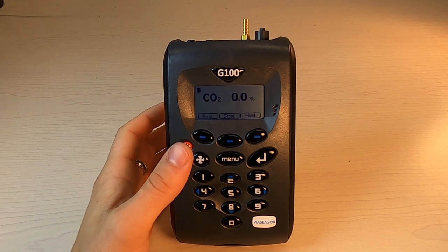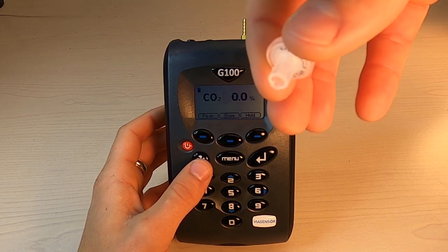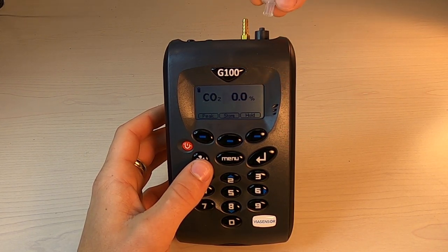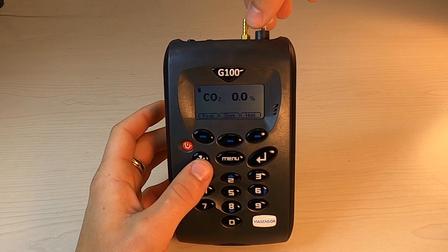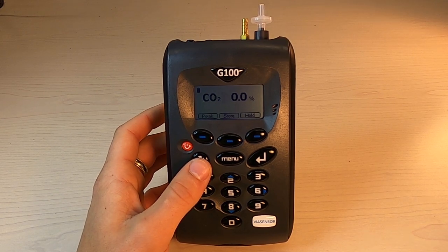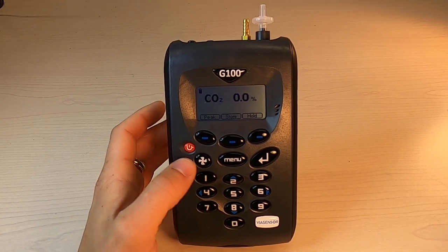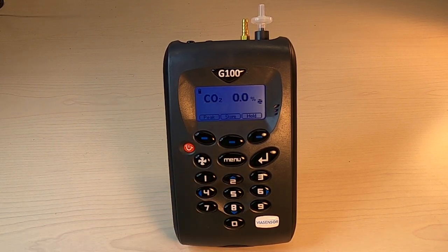That means running a clean air purge. When running a clean air purge, you'll always want to have a sample filter connected. The wide end goes just over the intersection of the inlet port, and you gently twist it clockwise until it stops and it's flush. Then to run the clean air purge, you just press the pump key — you'll notice the fan icon appear on the right-hand side of the screen.